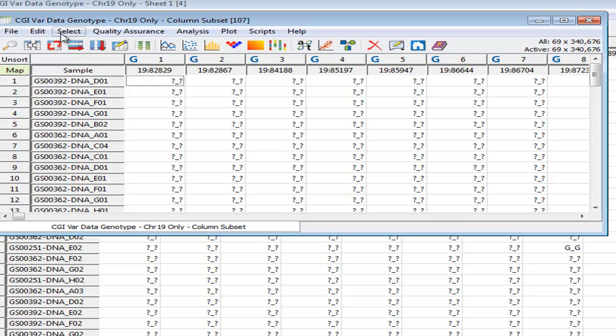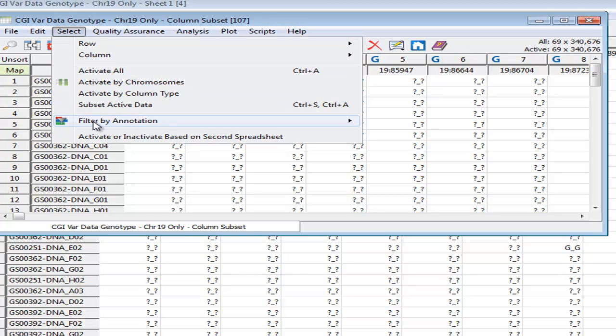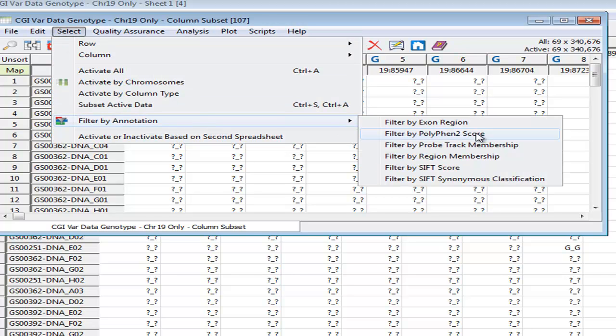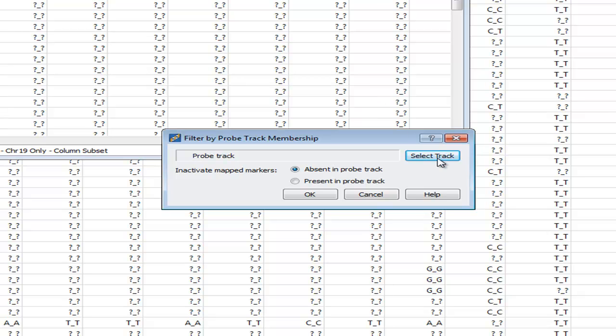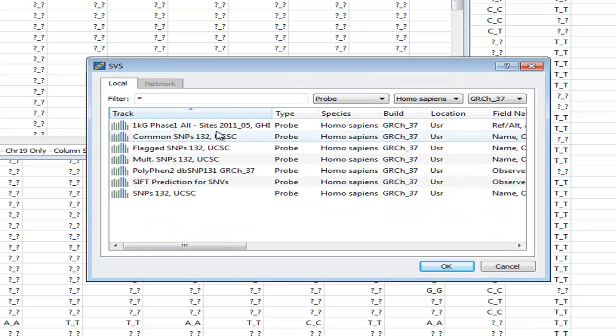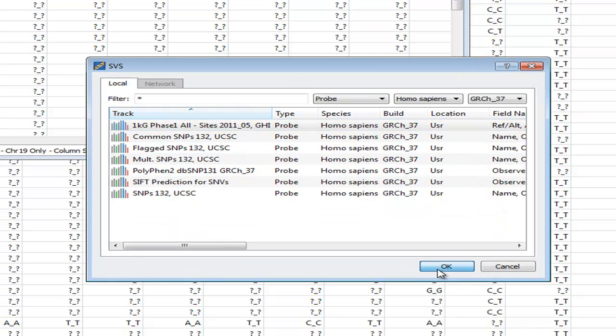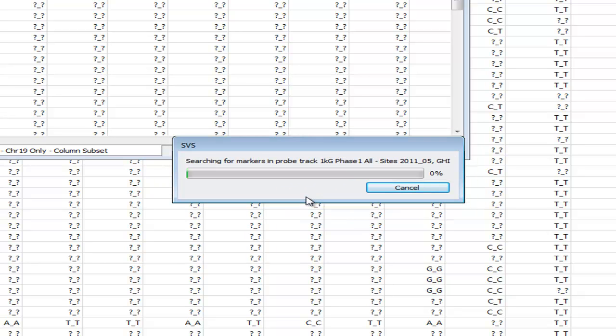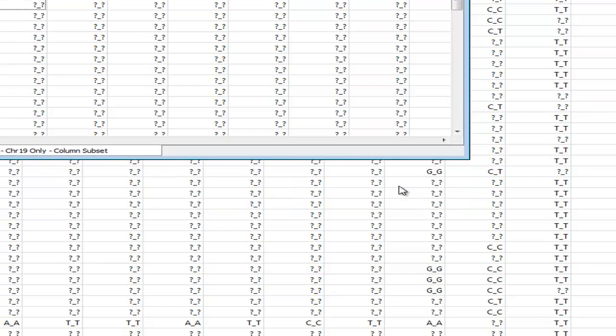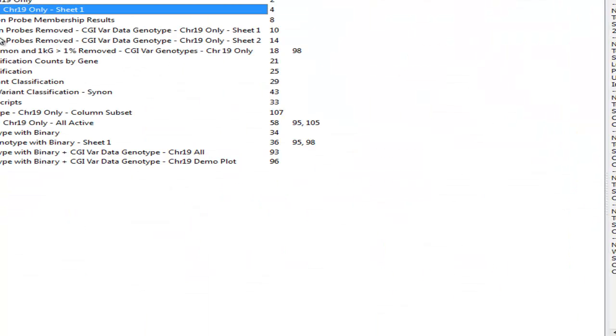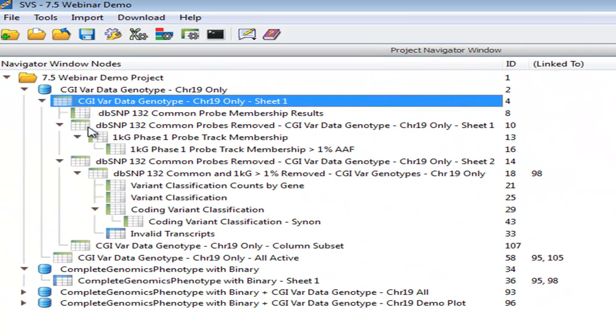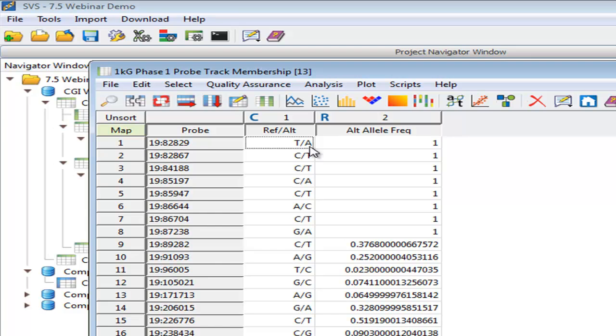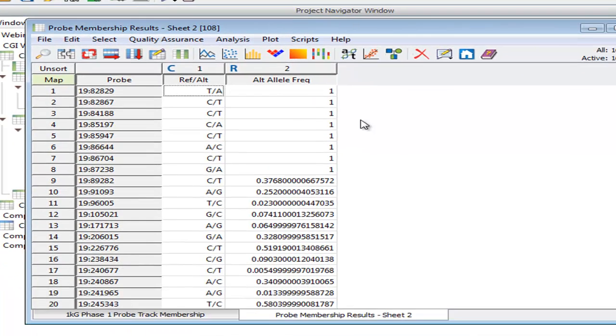From this point, we would do another filtering step, like I showed in my funnel earlier. And this time we're going to choose, using the same feature, Filter by ProbeTrack membership, the 1000 Genomes Phase 1 Variant Sites. And we're going to again choose to make anything that is in that to be inactive. Again, this is going along at a good clip, but I've also completed this analysis, so let's just jump to that.